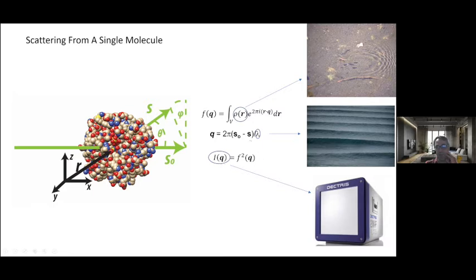And this Q thing, really, you can imagine that all of it depends on sort of the wavelength that's coming in, and that shape will change. By plotting it as intensity versus Q, regardless of the wavelength and sort of amplitude of these things, you're always going to get the same pattern. So that's what this Q thing does.